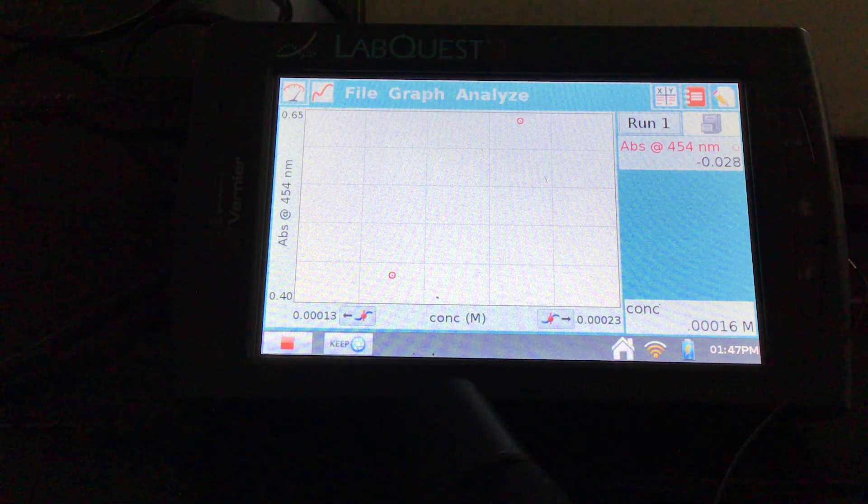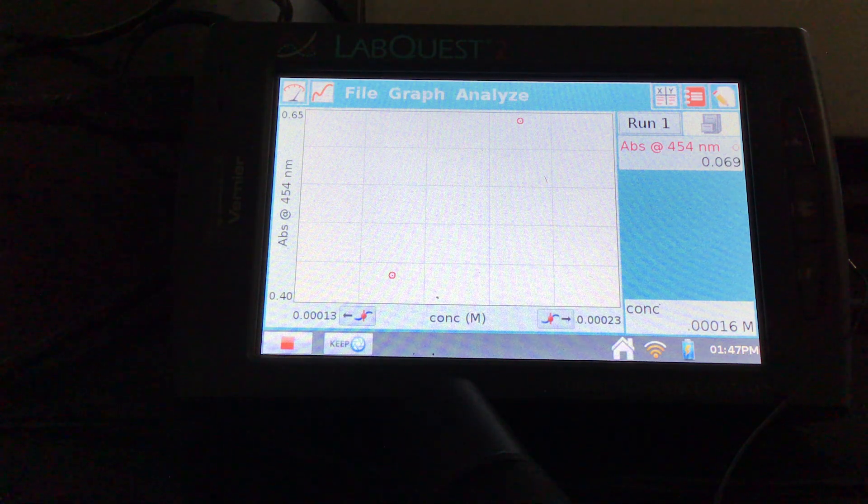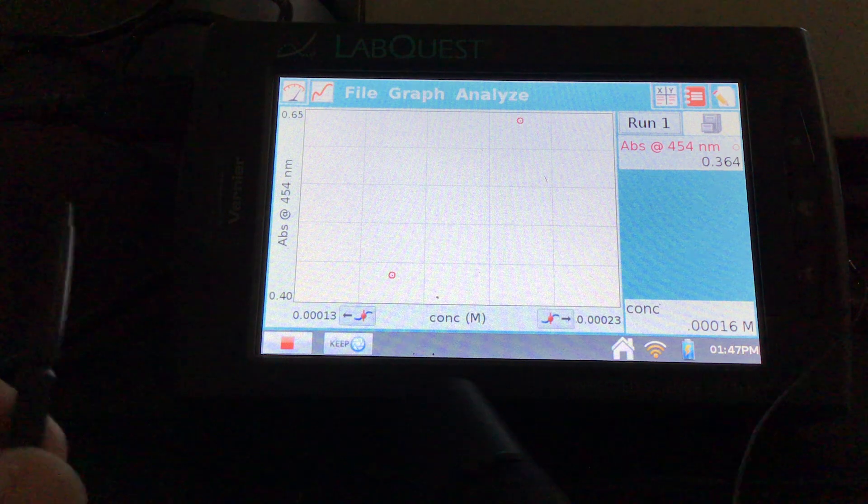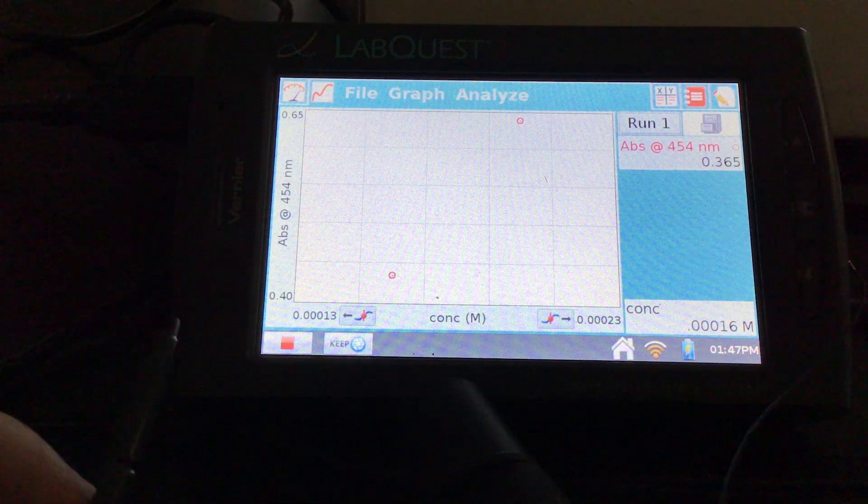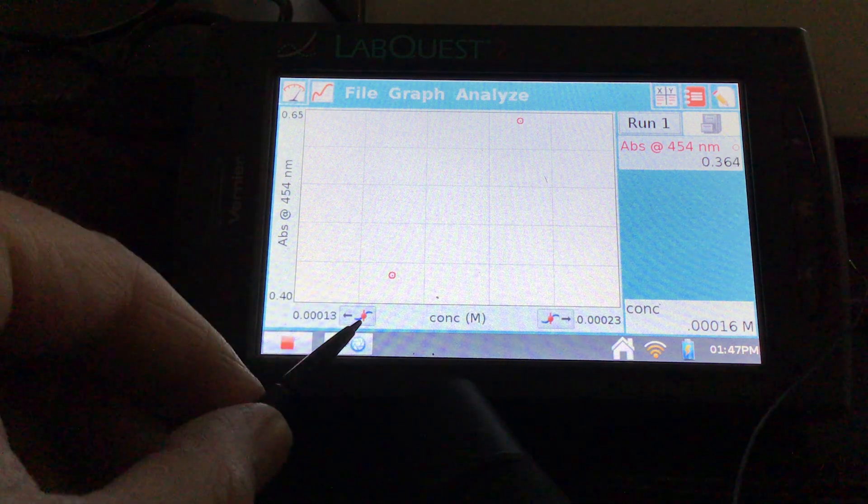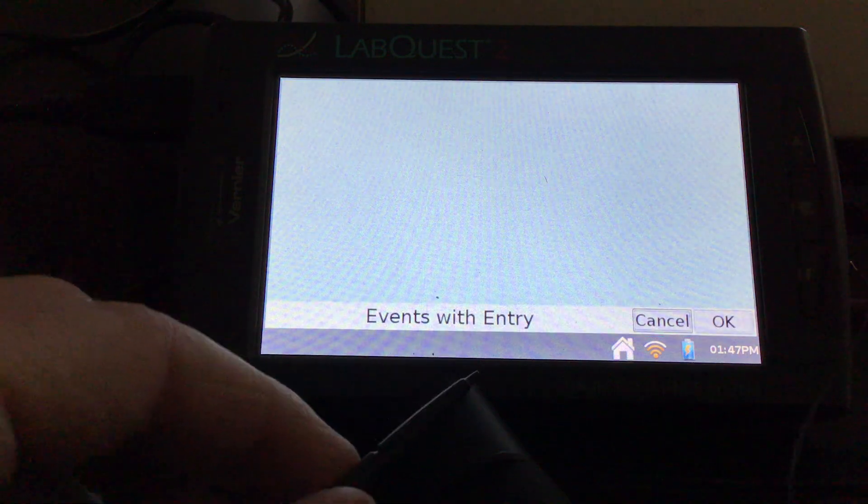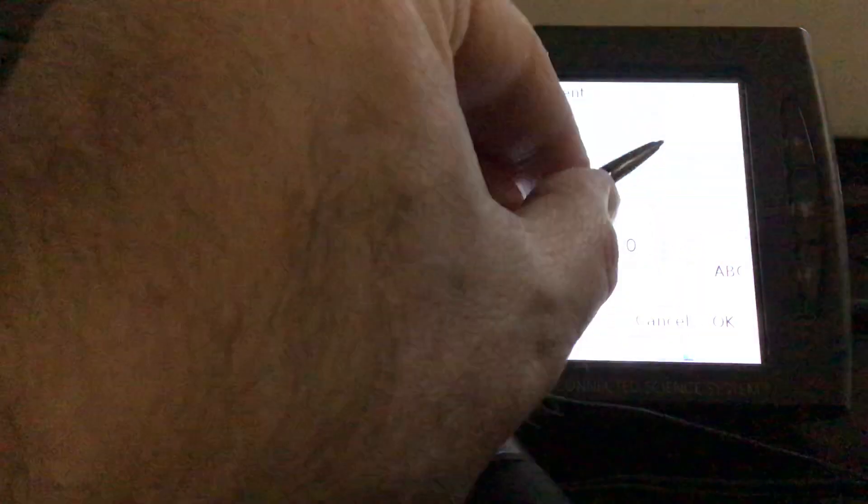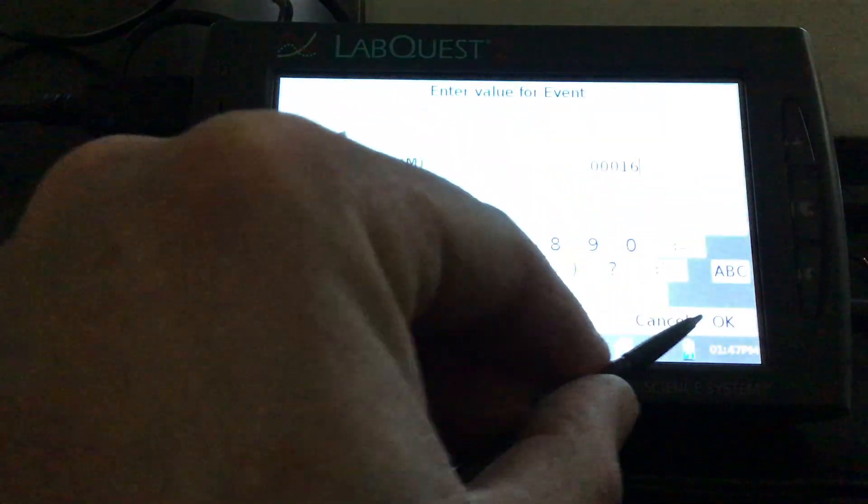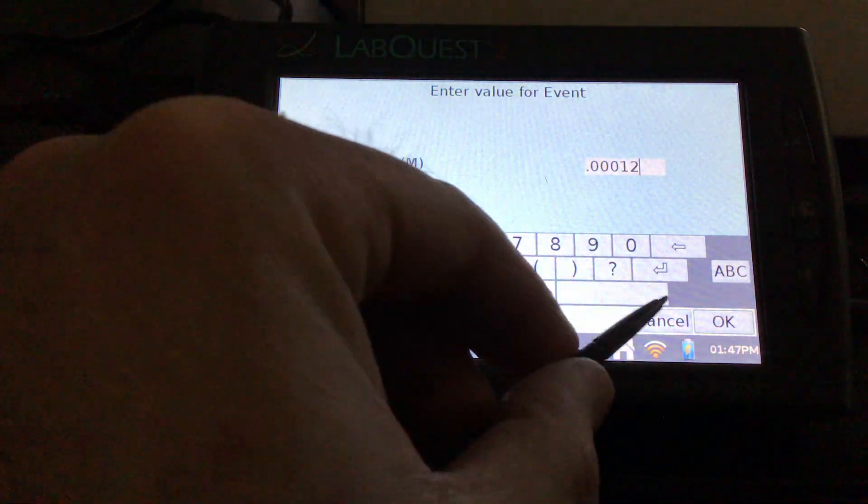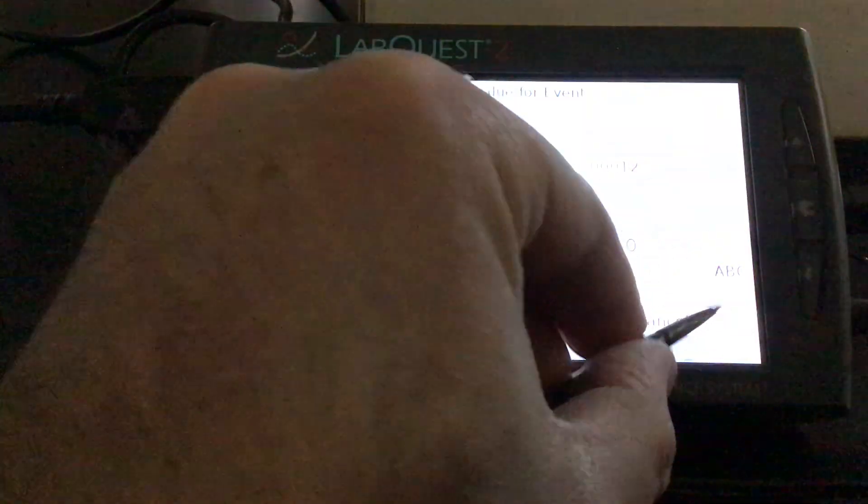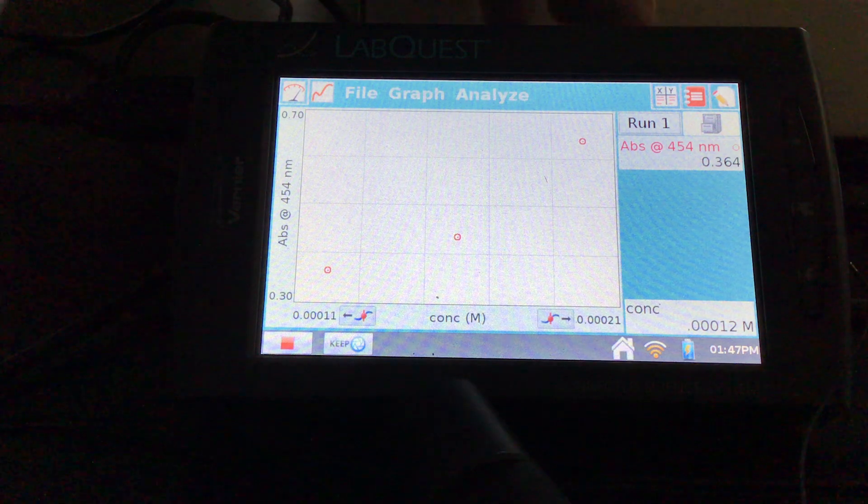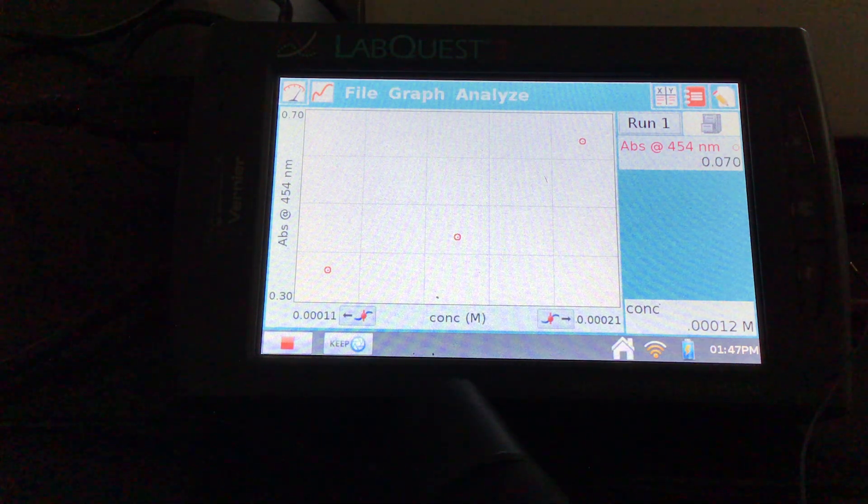And doing this for our other samples, making sure we have a nice clean cuvette right in between. It looks like the absorbance is pretty stable. Press keep. This concentration is 1.2 times 10 to the negative 4th. So change that there. Hit OK.